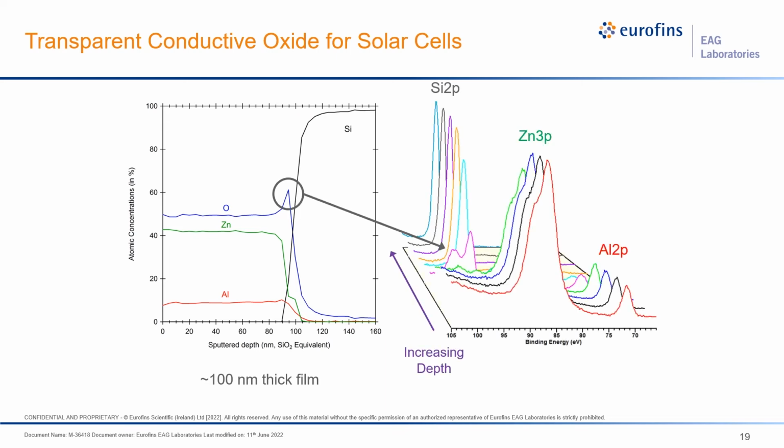In the left-hand image, we see the XPS depth profile of an aluminum-doped zinc oxide film on silicon, and we can see that its composition is constant with depth. The depth scale is not accurate since the beam's sputter rate was calibrated on SiO2, and different materials sputter at different rates. As is, this depth scale is good for making relative thickness comparisons. If an accurate depth scale is needed, the film thickness could be determined with a cross-sectional measurement by SEM or TEM, perhaps also X-ray reflection.